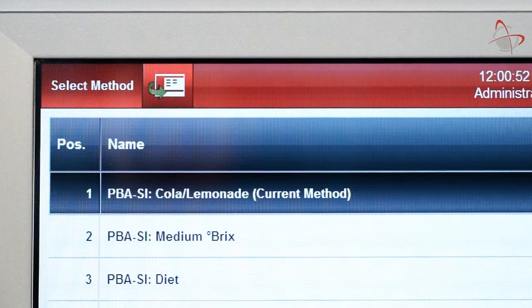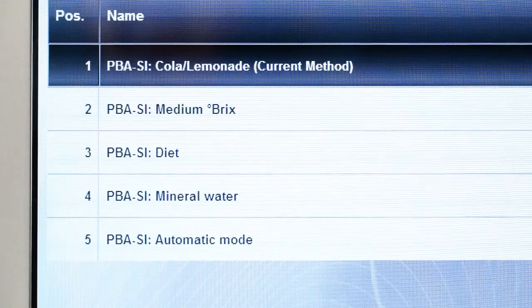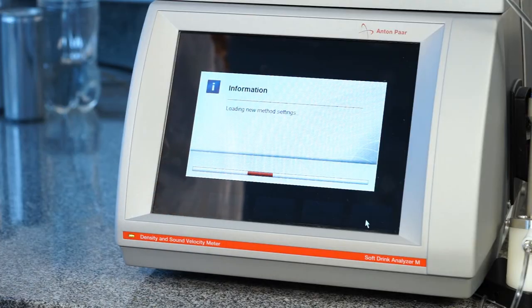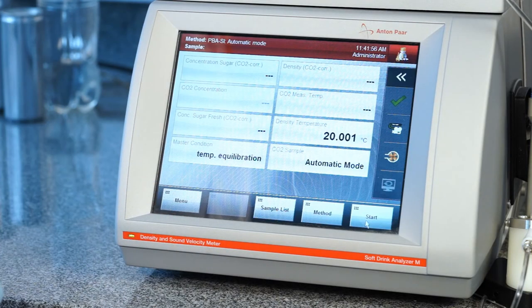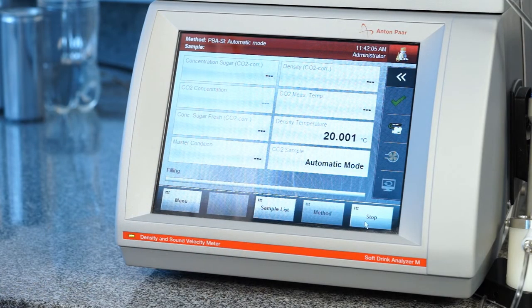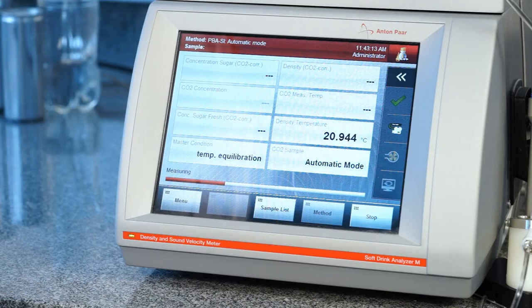The sample is prepared for the transfer. Now select the appropriate method depending on the sample type which is going to be measured. Once the method is selected, you are ready to start the measurement cycle. The sample is transferred automatically from the container to all measuring cells. While filling, gas bubbles should not be continuously visible in the hoses. In case there are, please see the instruction manual for further steps.